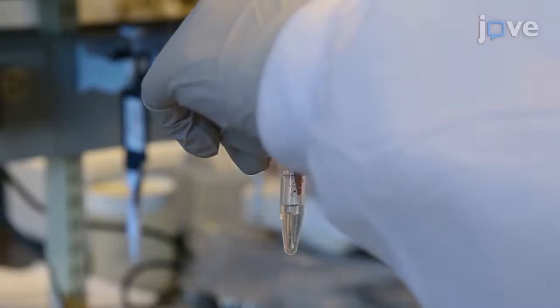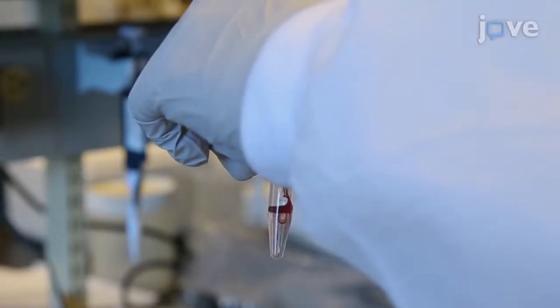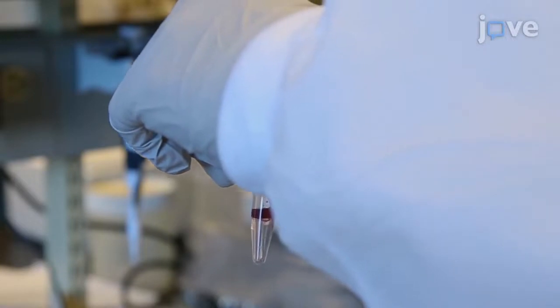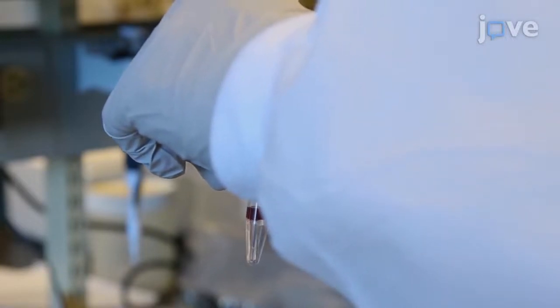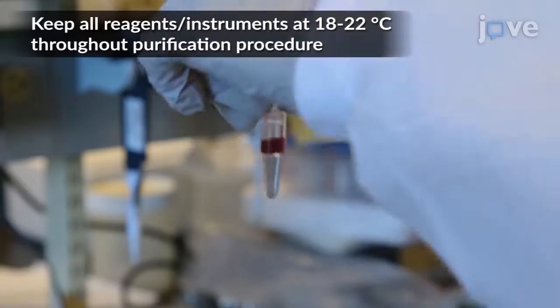To purify the platelets, use a wide-bore pipette tip to layer 200 uL of freshly harvested whole blood slowly down the side of a 1.5 mL tube onto 600 uL of iohexol gradient medium without mixing.